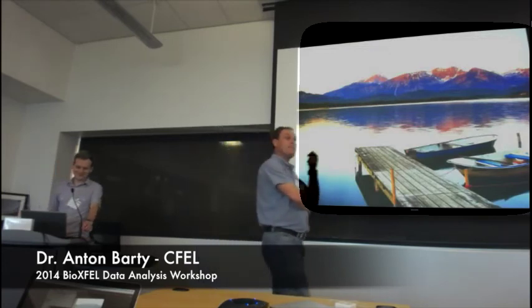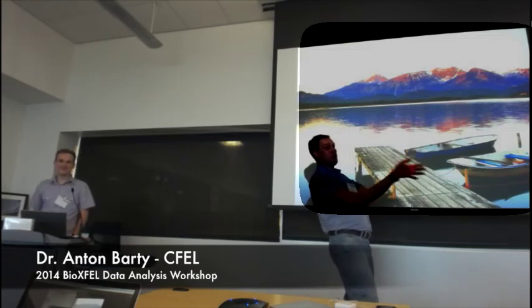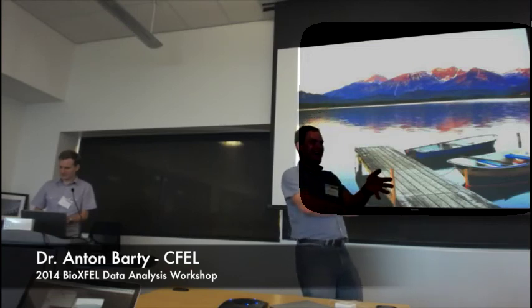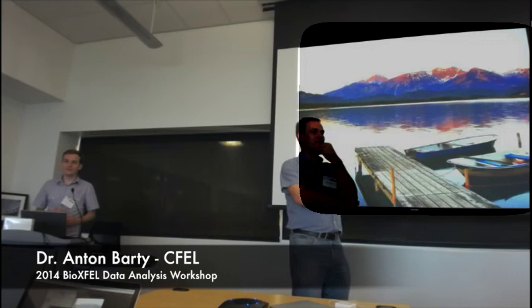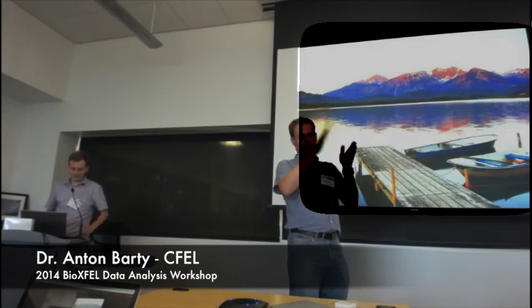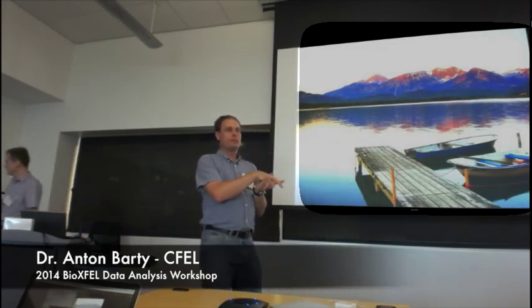The other month, we went back and reprocessed that using our current state of the art, and we can push the resolution to about 1.6 angstroms and index twice as many patterns and get much better statistics out of it, possibly because some of these things are now done a lot better. With this radial peak finding we don't need to do the local background subtraction.